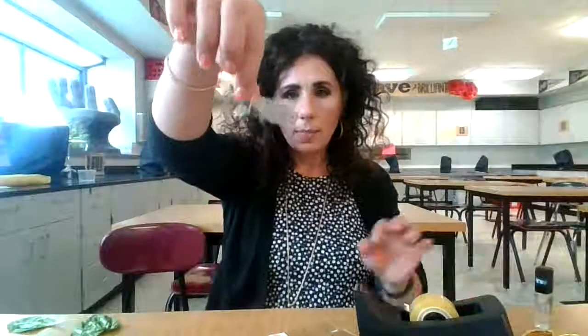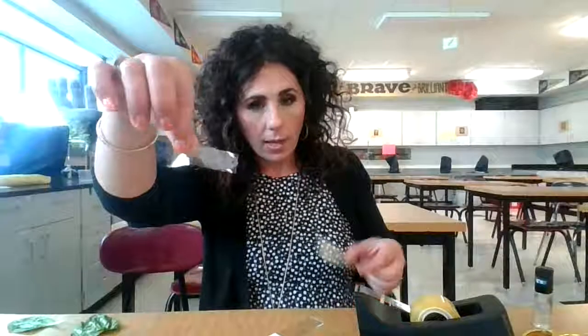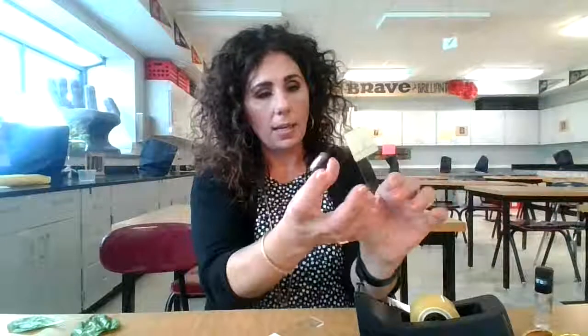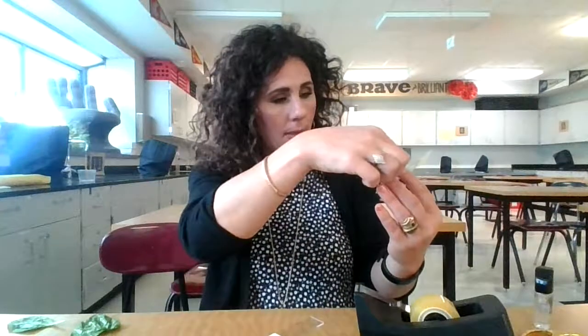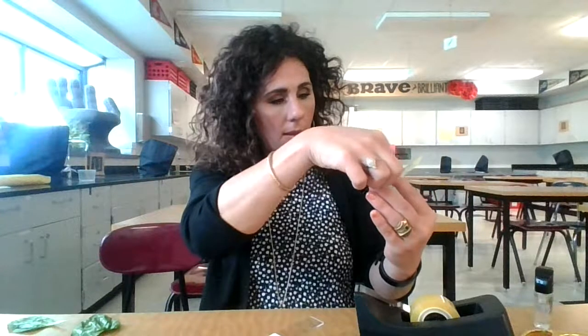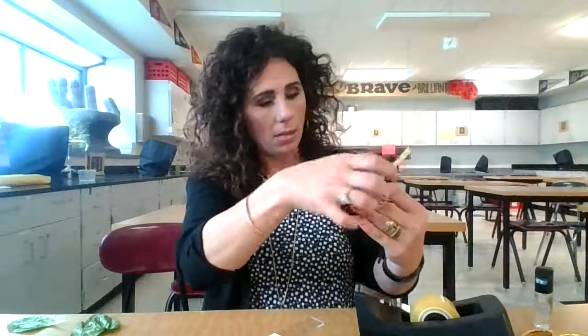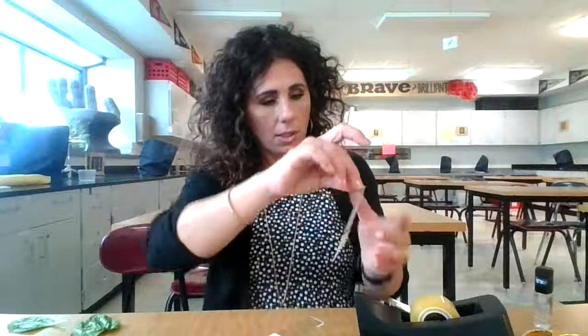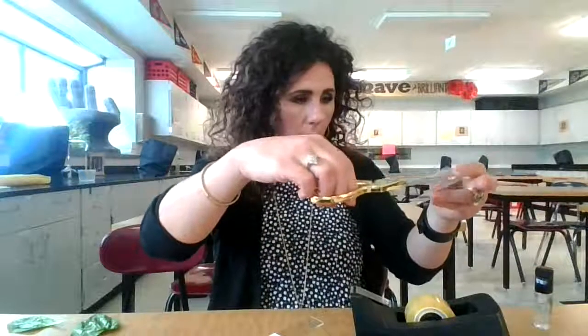There is my sample from the upper side. I have labeled my slide in advance so that it says 'upper,' and I'm going to be setting this onto the slide. I'll snip off the excess tape where my fingerprints were.